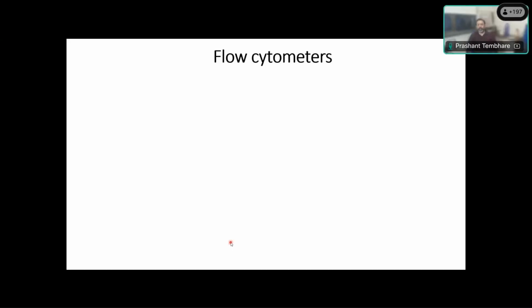Now, since we have students who have not seen the flow cytometer and flow cytometry technique, and today's talk is focused on flow cytometry, I will take you through a couple of slides on the basics of flow cytometry to have a general understanding, so that we are on the same page and you have some understanding.